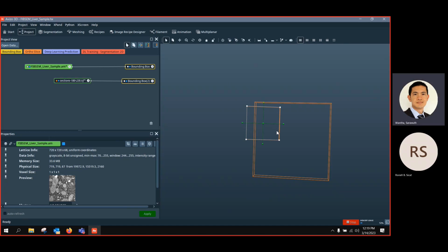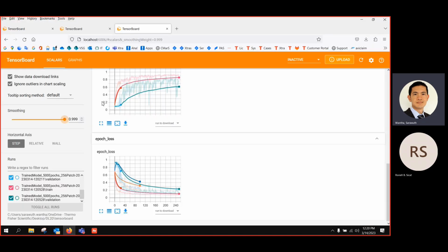Yeah, if you have a lot of data, you could. I think we could create a script, but I never have. I'm not sure if we have a module to crop the data to the same size, same dimension. We don't have it, but I just took a quick look at the Xtra library.